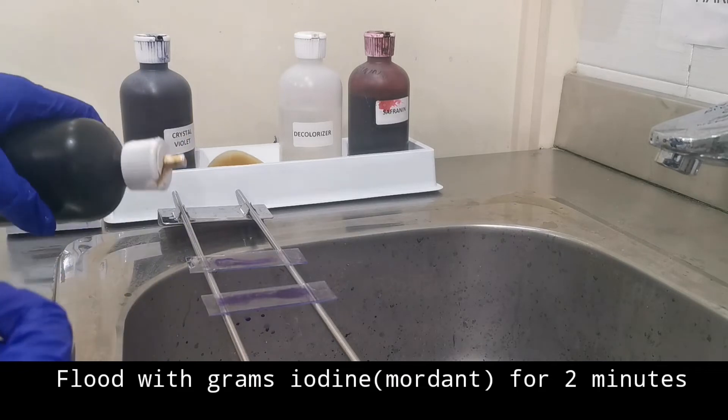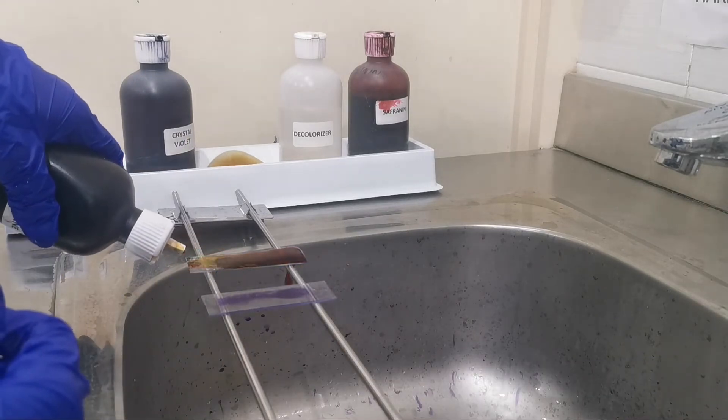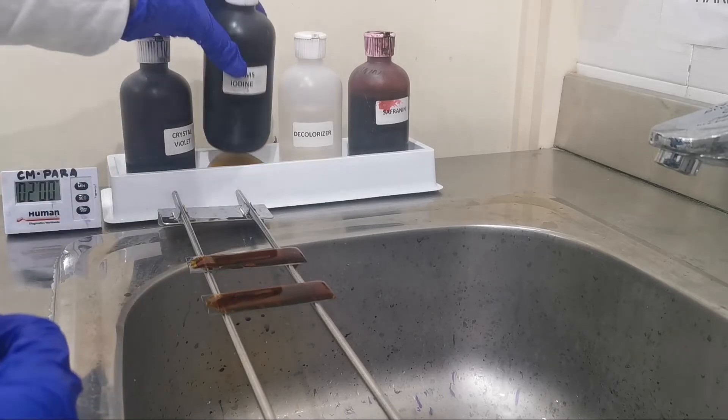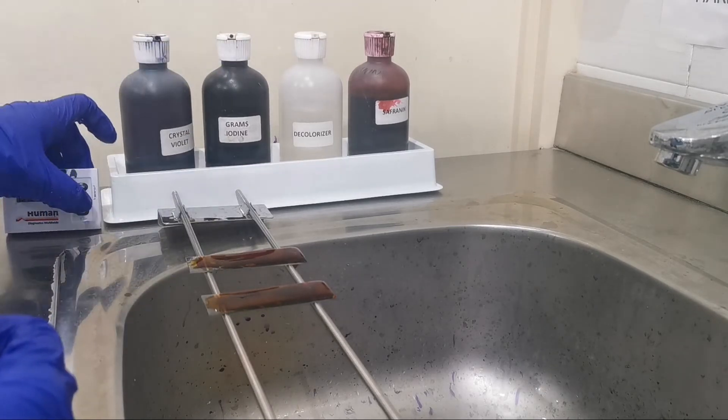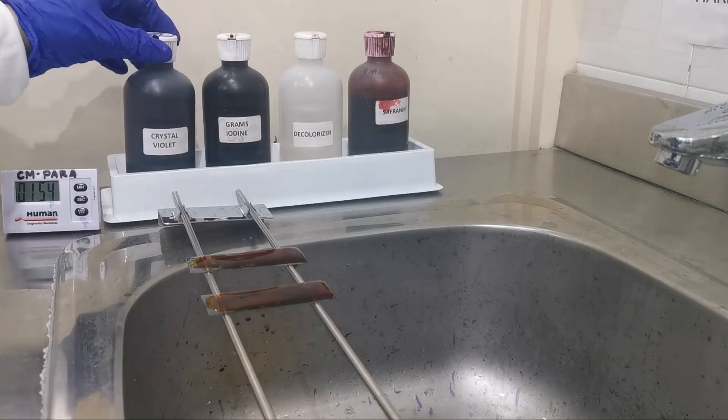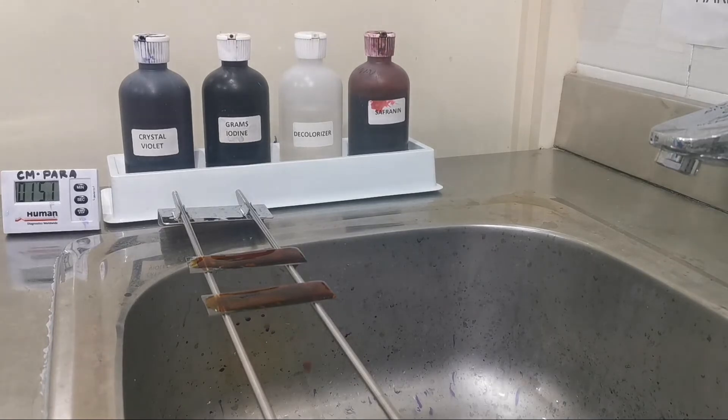What is the purpose of our Gram's iodine? Our Gram's iodine acts as a mordant. The role of a mordant is to intensify our primary stain — it does this by forming a complex with the primary stain.